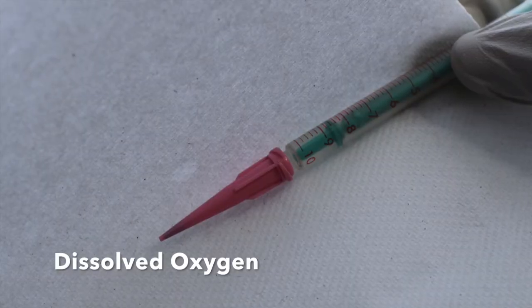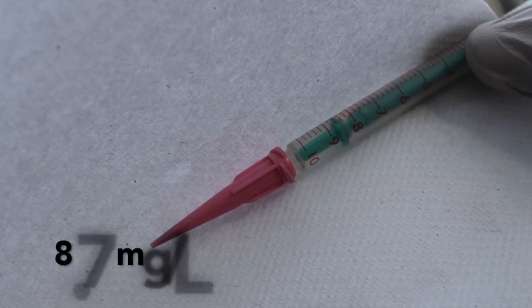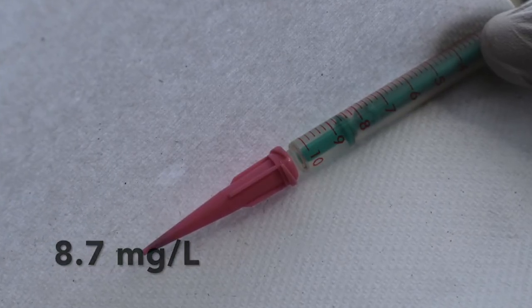At this point, we look at the titrator and read it based on the lowest ring in the plunger. This one displays 8.7, which is our dissolved oxygen value in milligrams per liter.